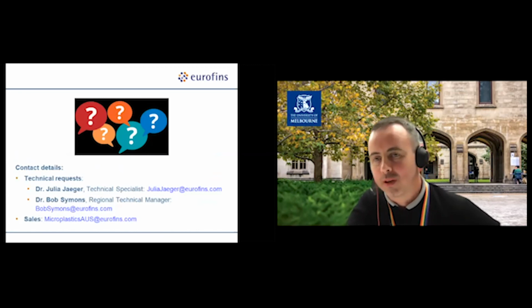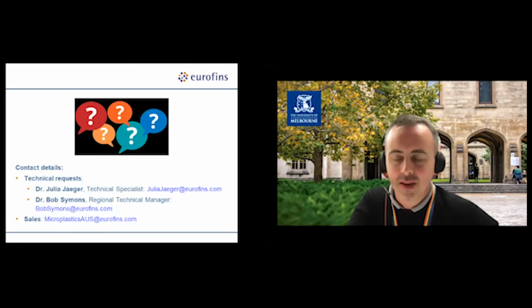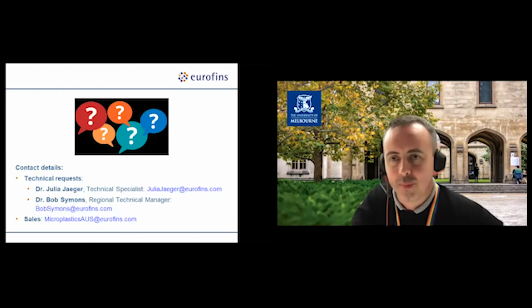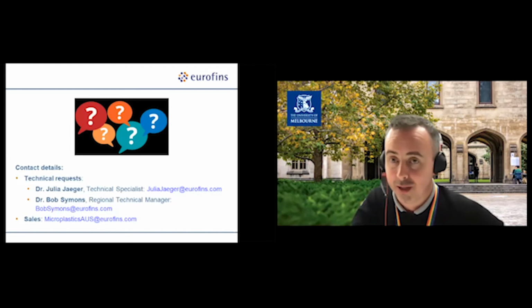And also, people might not realise this, but you're actually in the lab at the moment, and behind you is the LDIR. And in my opinion, in microplastics, accuracy, reproducibility, and precision are some of the hardest things to do with microplastics analysis, and the work you're doing is moving us in the right direction. Could you tell me about the blanks?